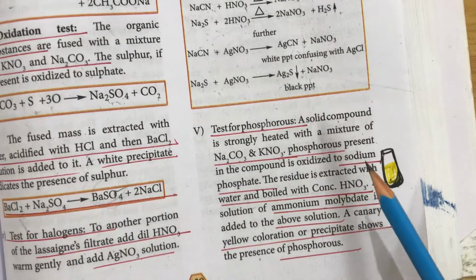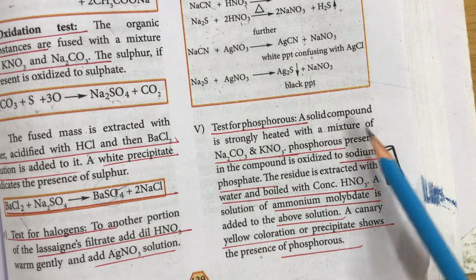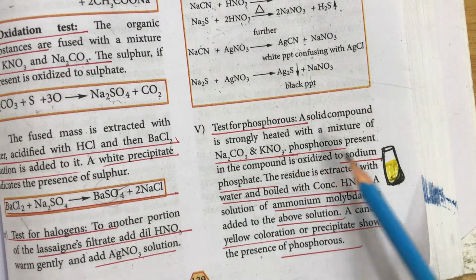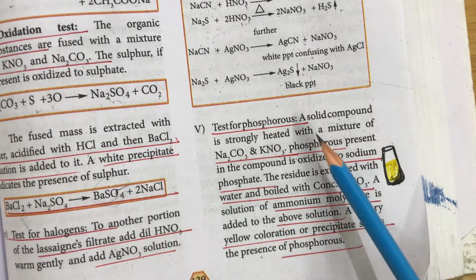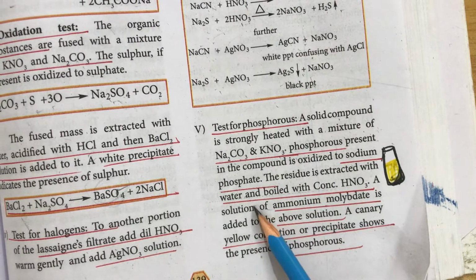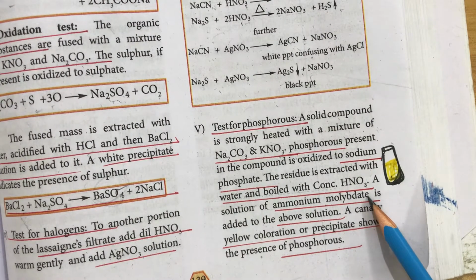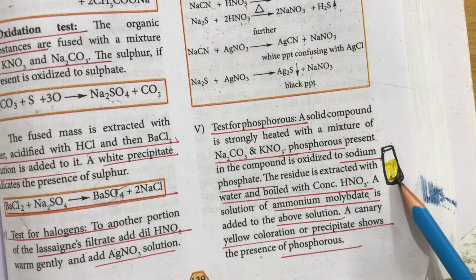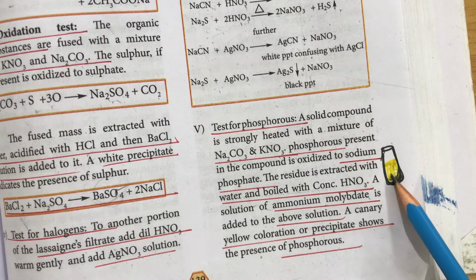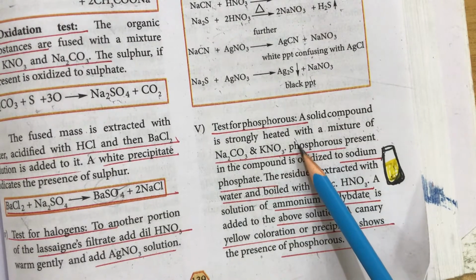The last one is the test for phosphorus. The organic compound to be tested for phosphorus is heated with sodium carbonate and potassium nitrate. Phosphorus present in the organic compound is oxidized to sodium phosphate. It is extracted with water by dissolving in water, then boiled with concentrated nitric acid and ammonium molybdate. It gives a yellow coloration, canary yellow coloration or yellow precipitate, which shows the presence of phosphorus. This one is the test for phosphorus.